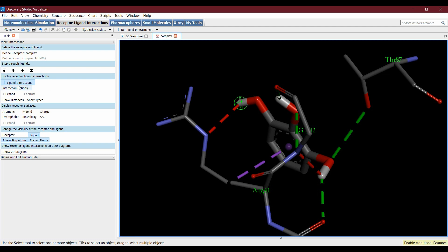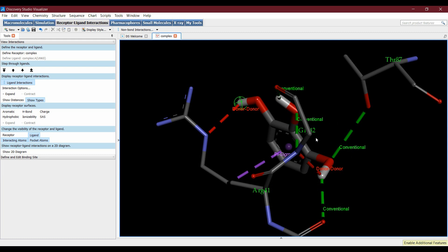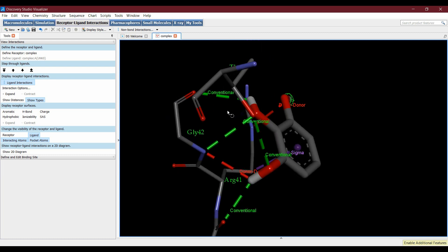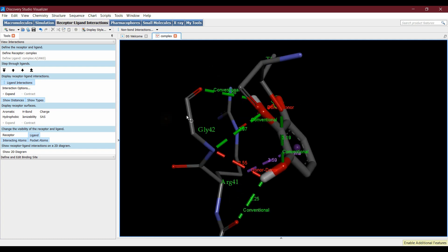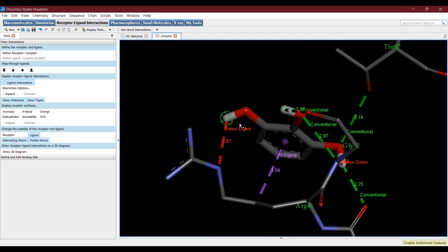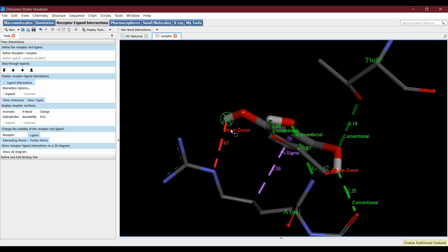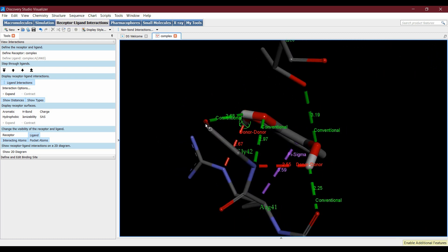Under Ligand Interactions, select Show Type — this will show the bond types; 'conventional' means hydrogen bonds. Then select Show Distance — this will show the bond length between the residue atom and the ligand atom.